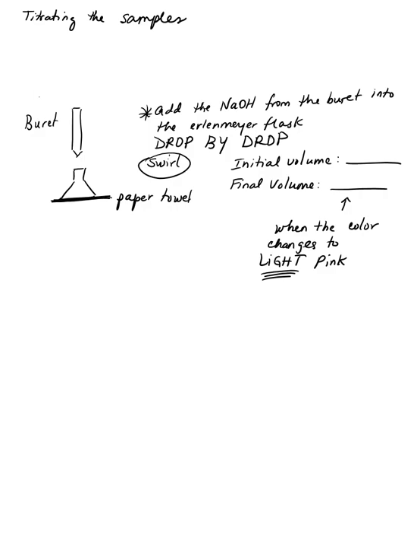So you need to copy two experimental data points. In the beginning of your titration, before adding any sodium hydroxide, you have to check what's the volume of sodium hydroxide in your burette. Then you're starting to add your sodium hydroxide, and the sodium hydroxide will go into your Erlenmeyer flask until the color changes. At that point, you're going to close your burette and you're going to copy the final volume, which is the volume at which your sample changes color from clear to pale pink.